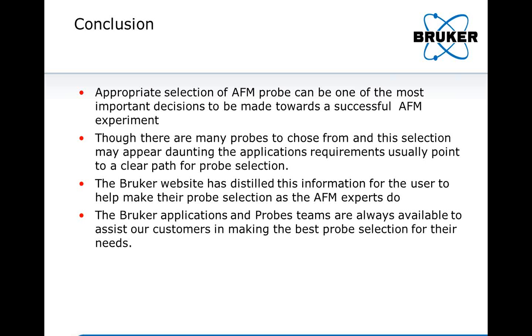Also on cleaning, I have some colloidal probes, borosilicate beads, that are dirty. How do I clean them? I think that was asked before the cleaning slide. Following these steps, one should be cautious of the adhesive used to attach the bead to the cantilever. Make sure that any solvents you use don't dissolve it. Yeah, that might be a category where you would want to try to recycle, but be cautious.